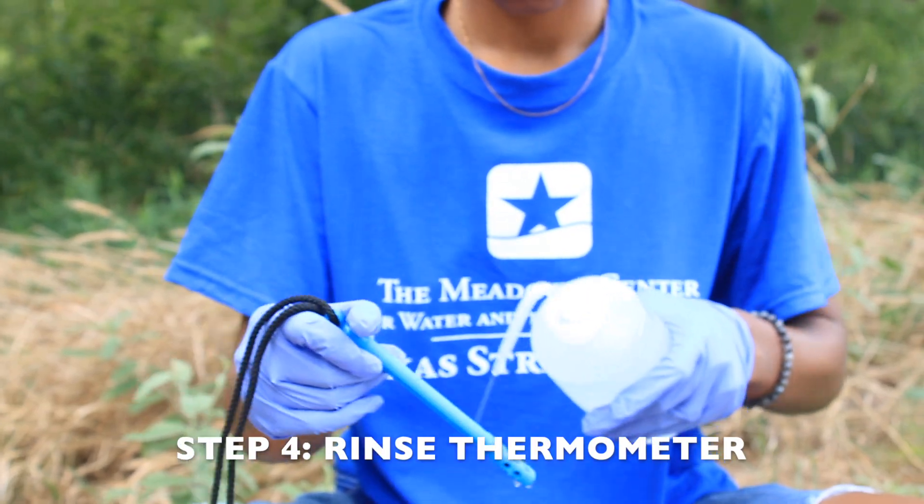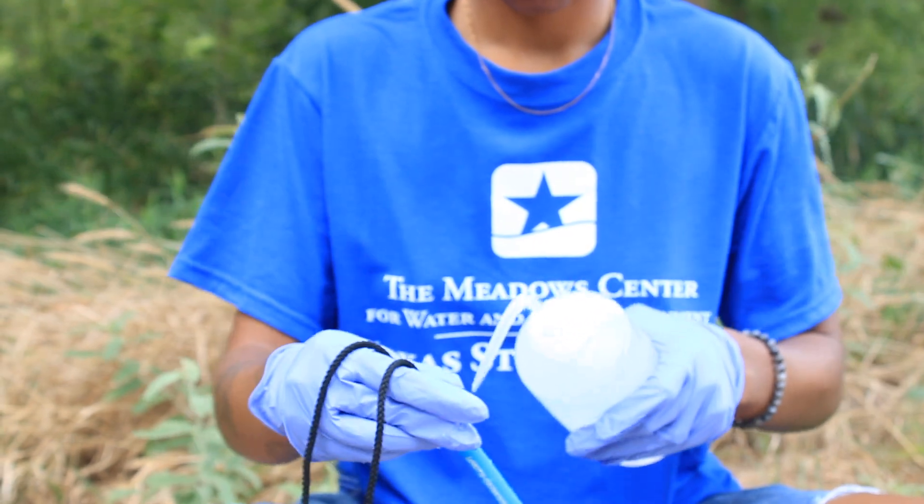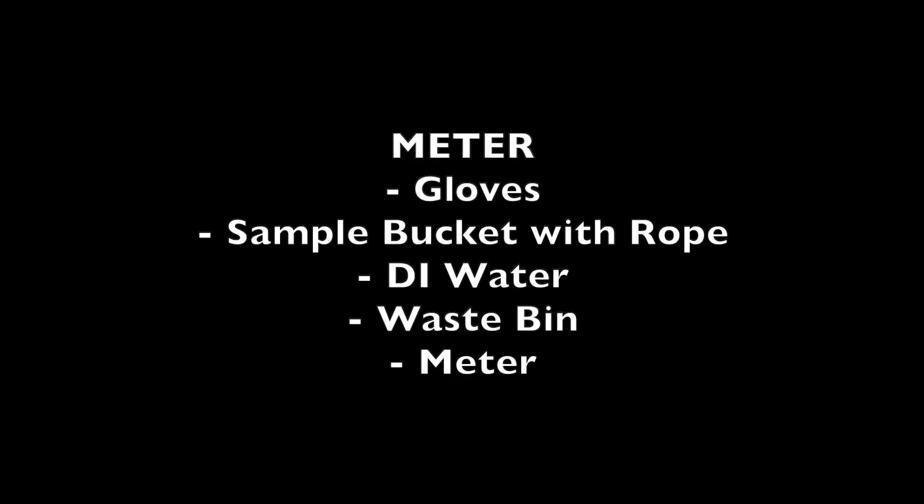Never take the thermometer out of water to read the temperature. Lastly, be sure to rinse the thermometer twice with DI water. Supplies needed for the meter method include gloves, a bucket of your sample water, DI water, a waste bin, and your meter.